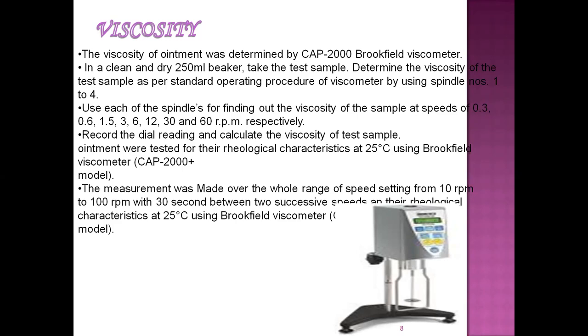Thereby, ointments were tested for their rheological characteristics at 25 degrees centigrade using the CAP 2000 model. The measurement was made over the whole range of speed settings from 10 RPM to 100 RPM with 30 seconds between two successive speeds, at 25 degrees centigrade.